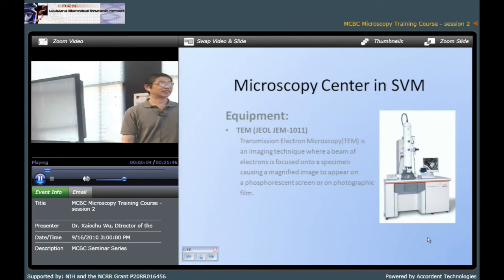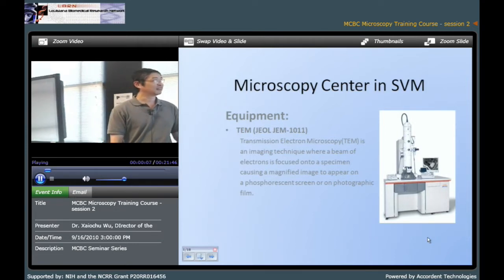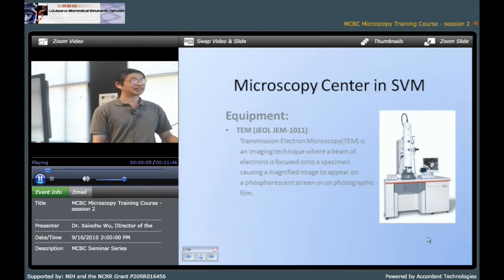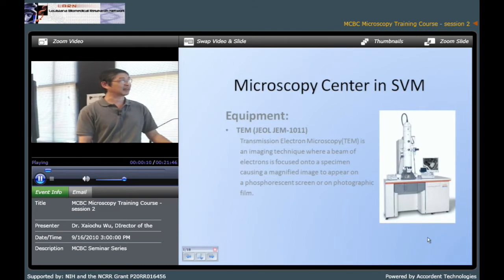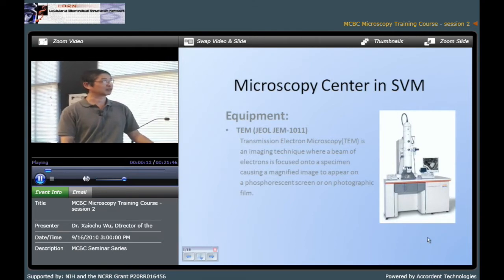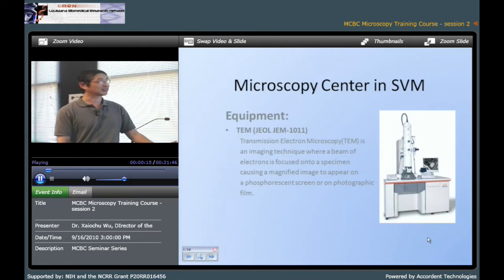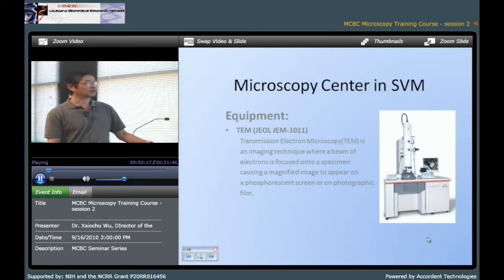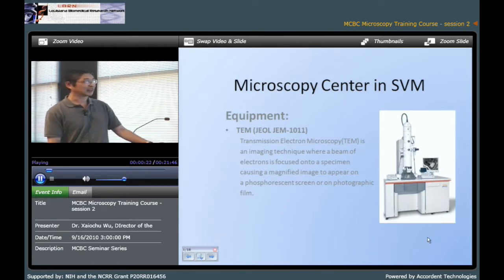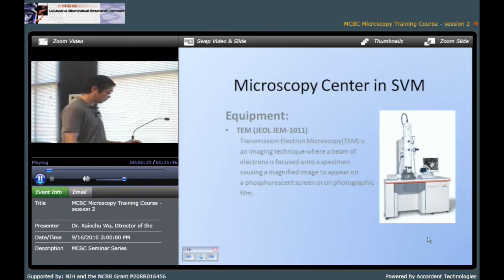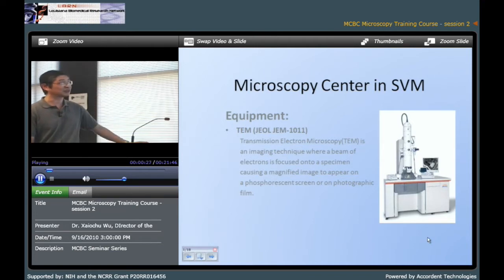I'm here to introduce some microscopy in our facility. First we have TEM which is JEM-1011. It was made by JEOL, which uses an electron beam to examine the specimen and get a digital camera image. You can save your image in your computer after you get this image.